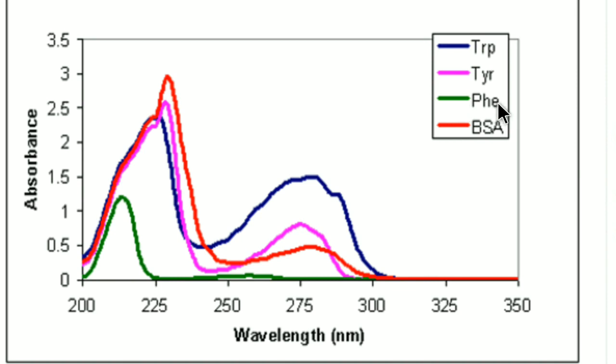This is for the phenylalanine amino acid. Under this, you can see it is subjected to absorption from 200 nanometer to 300 nanometer. So at 200 nanometer and after, it is showing a rise in the peak. After about 215 or 217 or 218 nanometer, the fall of the peak is taking place. So between 200 to 225 nanometer, there will be the absorption of this particular phenylalanine.